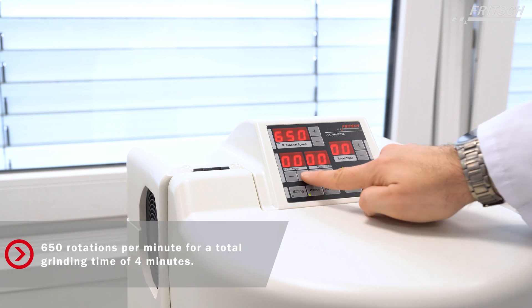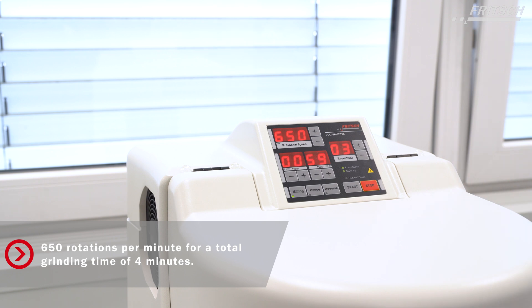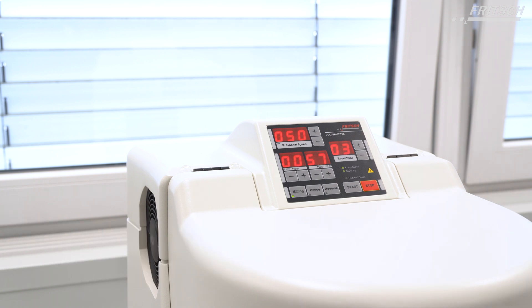The instrument is now set to run with 650 rotations per minute for 60 seconds with three repetitions. In between are two-minute pauses. These pauses are required to let the sample cool down and counteract the possible development of overpressure in the bowl.